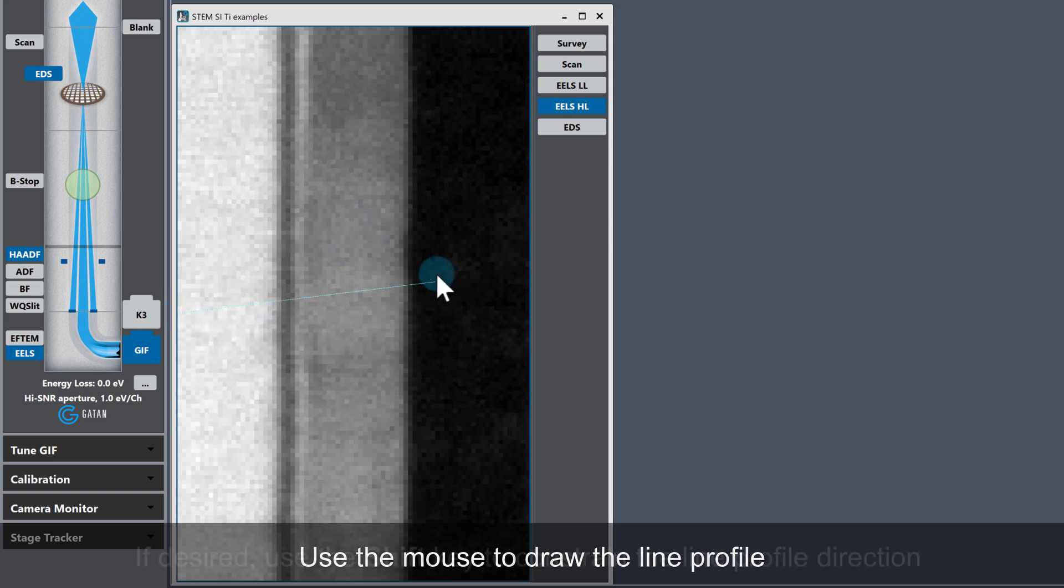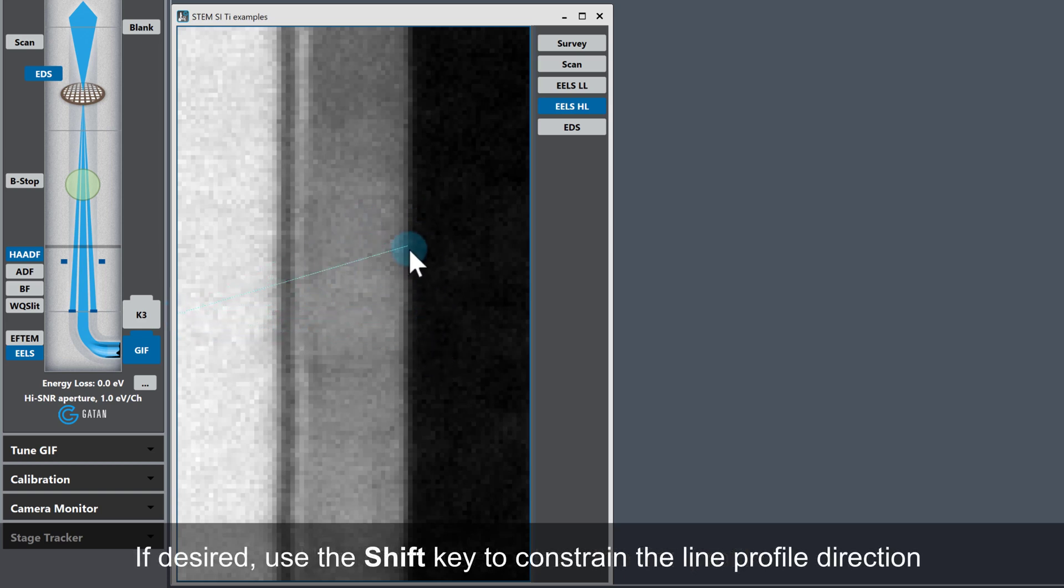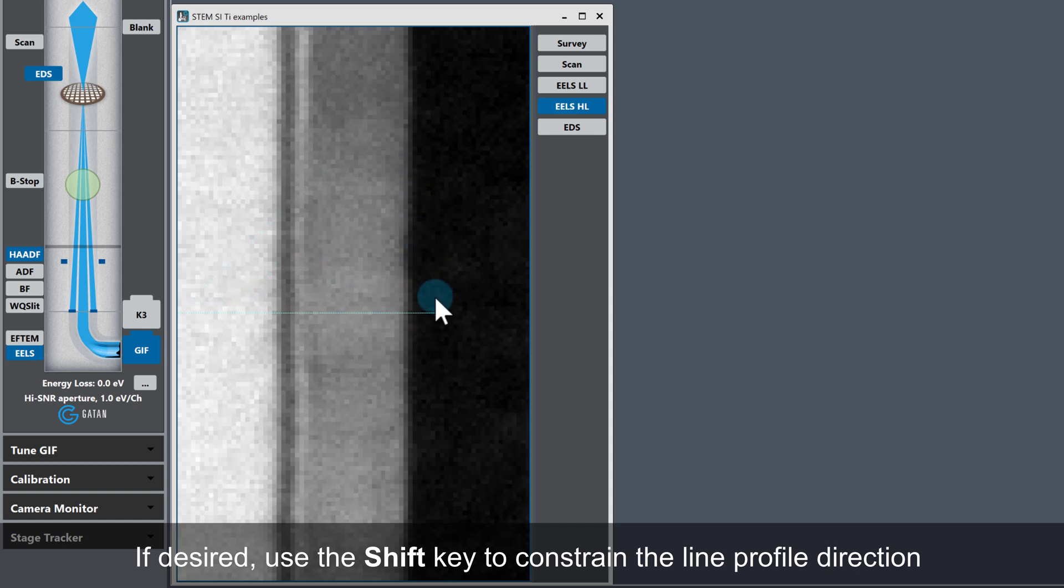You can hold the Shift key on the keyboard to constrain the line profile to be either parallel or at 45 degrees to one of the axes of the dataset.